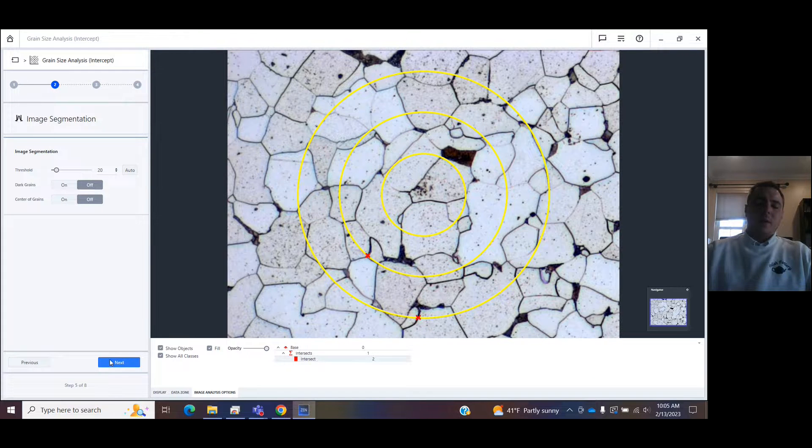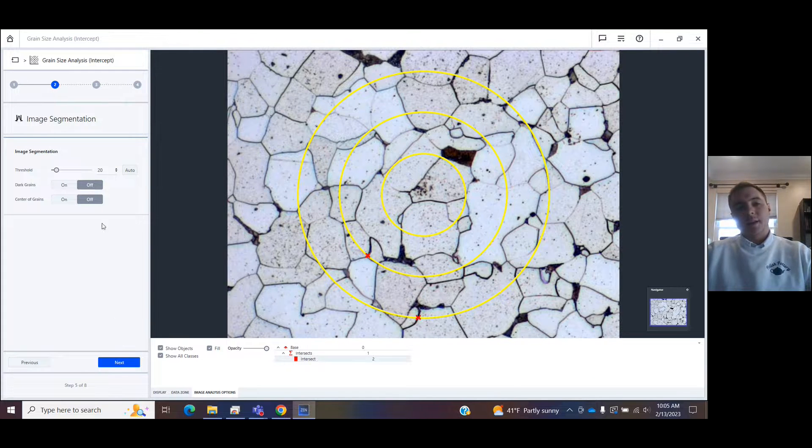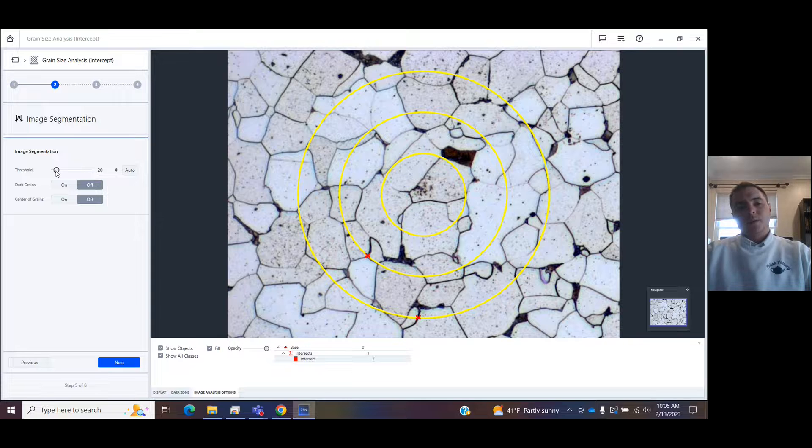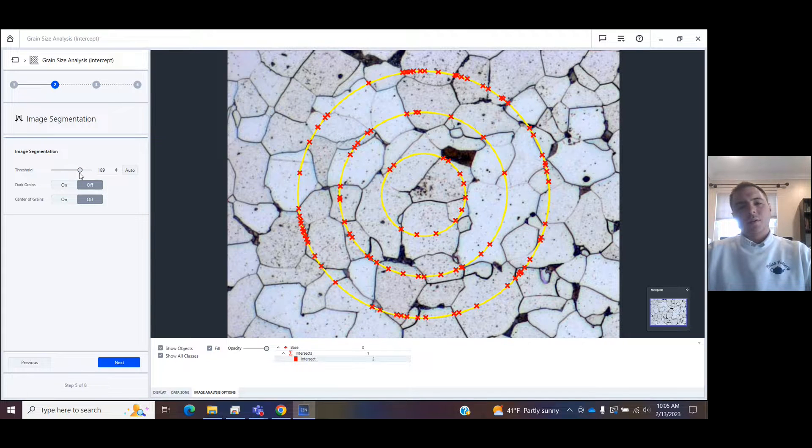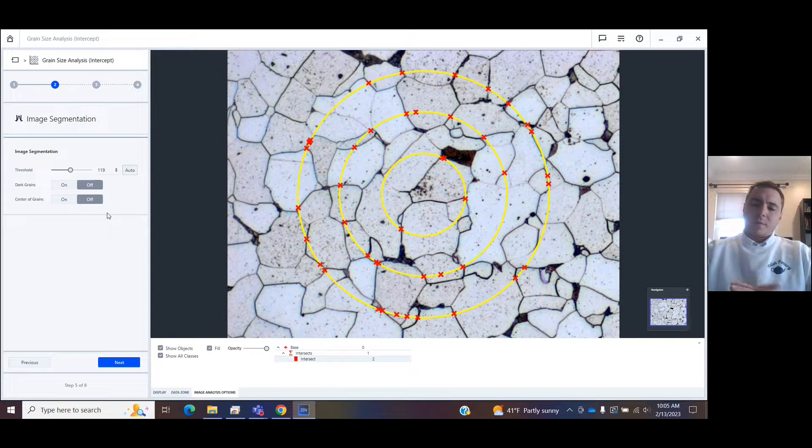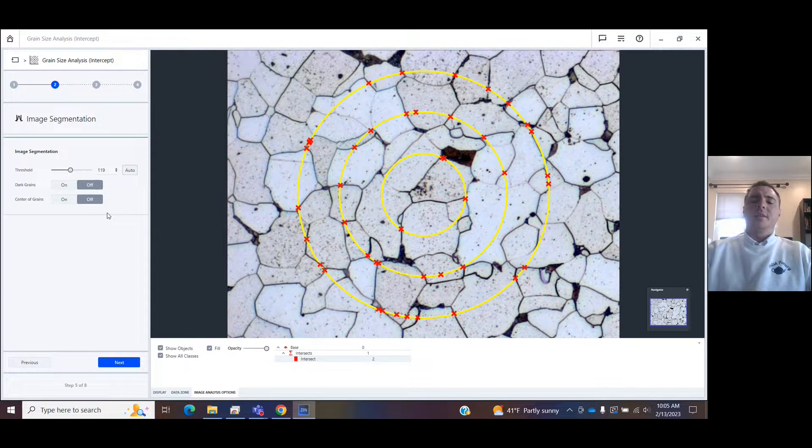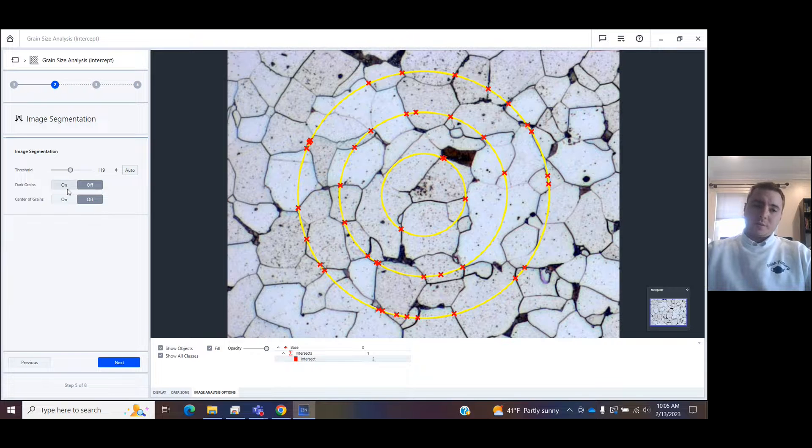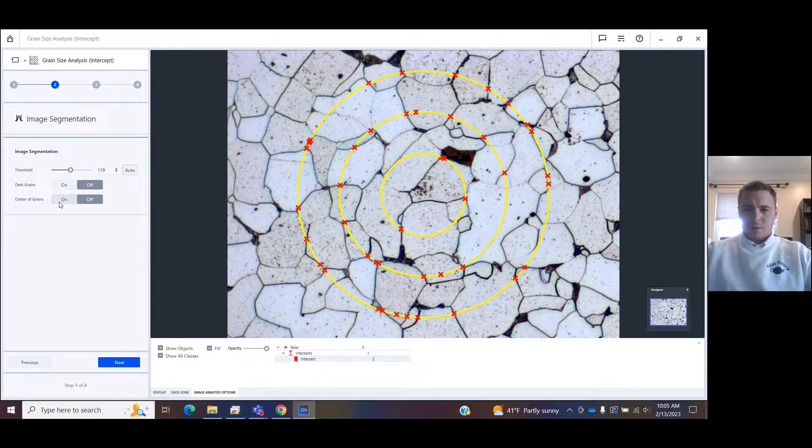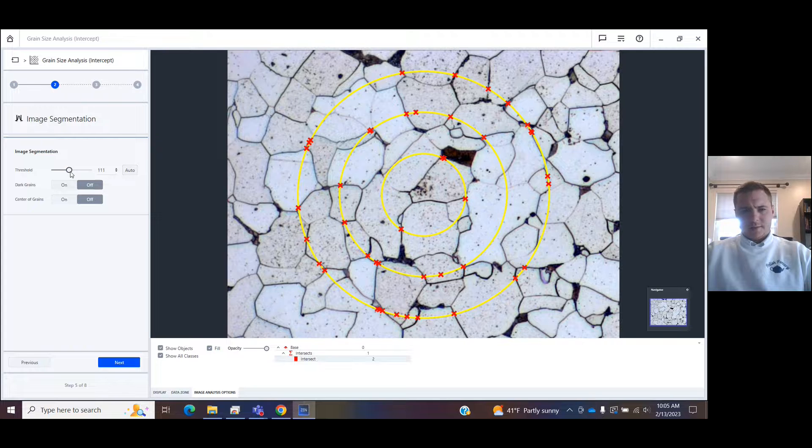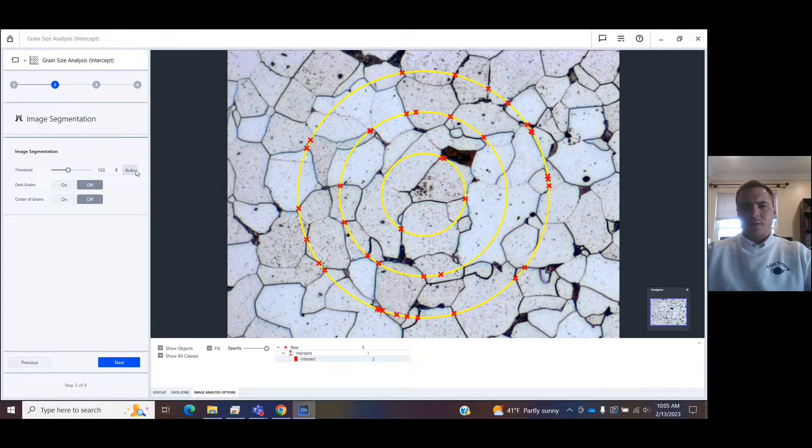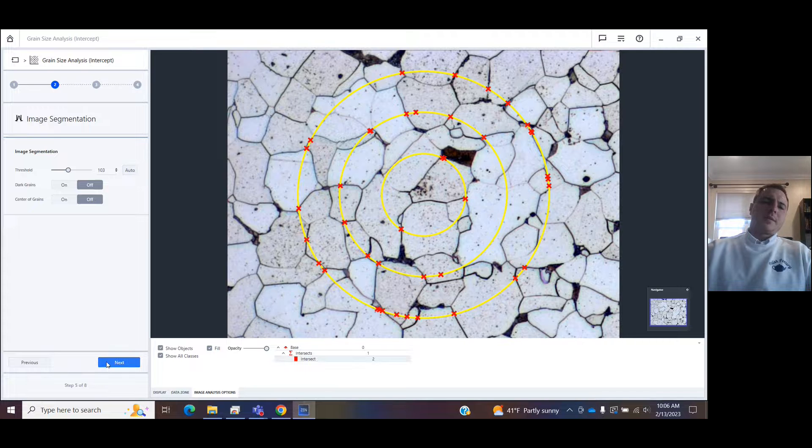Next comes the automatic image segmentation step. You can choose how sensitive you want this. You can press auto for the software to detect on its own where there might be some grain boundaries. You could also choose if you want dark grains or to go into the center of grains. So you can edit this on your own. You can use the auto to kind of get you close. Let's go with this.